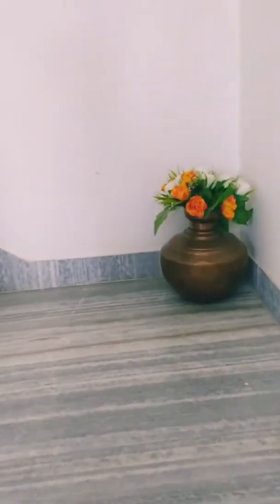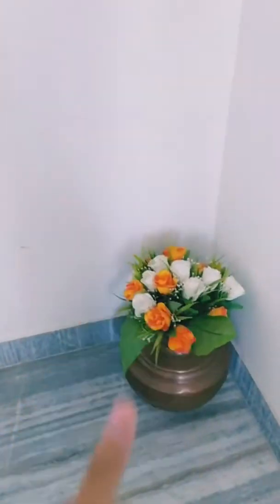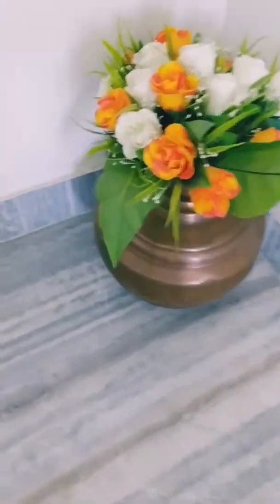If you want to see this video, let's see how dull and bad we need to clean it. Let's start with copper.